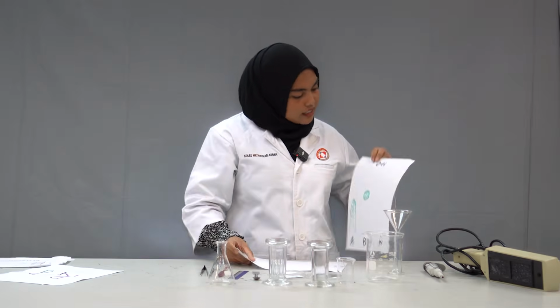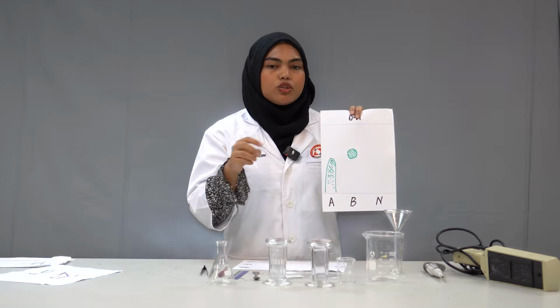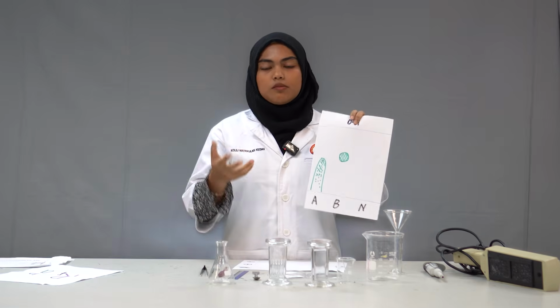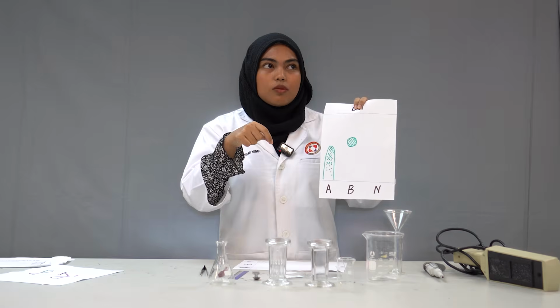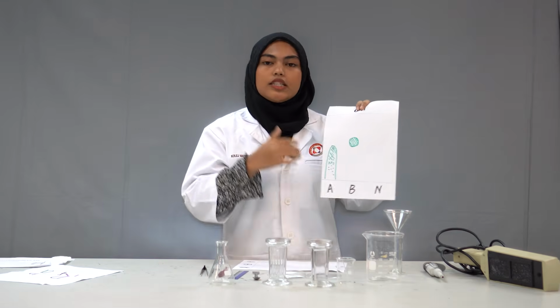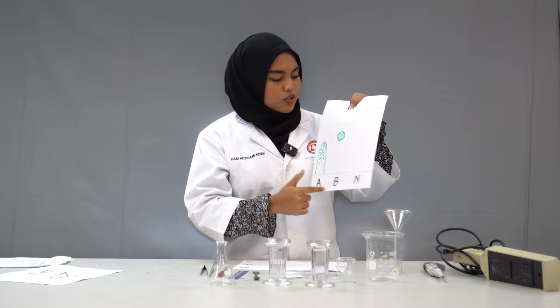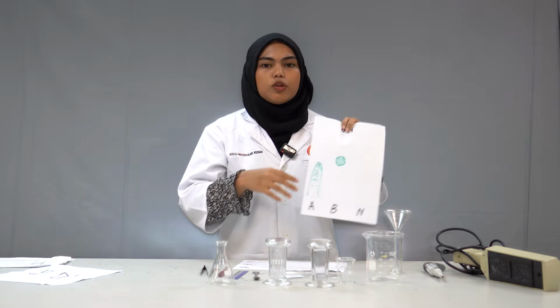Okay, for DCM and hexane, DCM is moderately polar, but the ratio to hexane is 9:1, so the mixture automatically becomes a polar solvent. So when we immerse the TLC plate in the polar solvent, the polarity of the solvent will make an interaction with the TLC plate, as the TLC plate is polar. When it interacts with the TLC plate, the compound will move further up the plate. So the hypothesis is accepted.